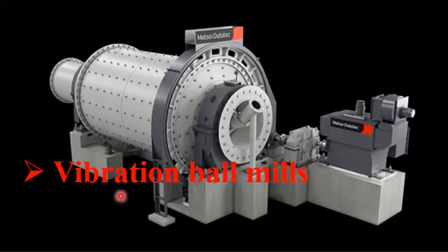Now, when the ball milling machine is vibrated, the balls inside will start to vibrate and interact with the bulk material. When the vibrating grinding medium, like a ball, interacts with the bulk material, it increases the rate of crushing of the bulk material. In this way, a huge amount of bulk material is converted by vibration into a fine nano powder.